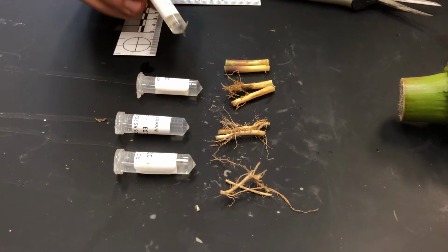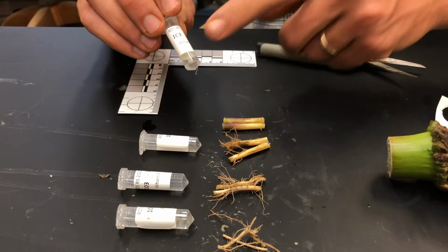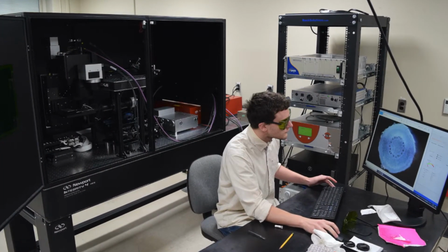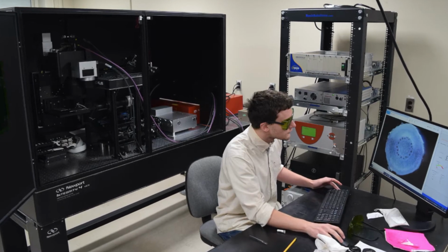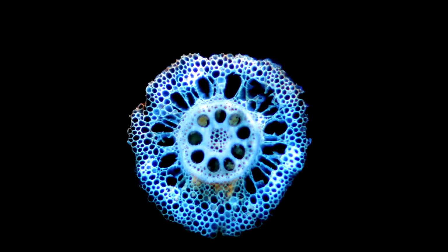Anatomy samples collected will be stored in 2 ml tubes filled with 75% ethanol. This will preserve the root samples until we can image the anatomy of these roots using our laser ablation tomography system at a later date. Using our laser system, no additional prep work to fix or stain samples will be needed, and they can be sectioned directly from storage in the ethanol solution.